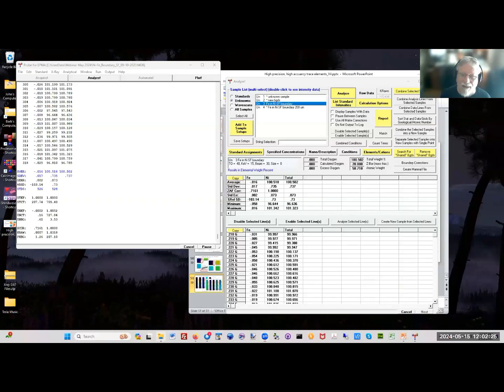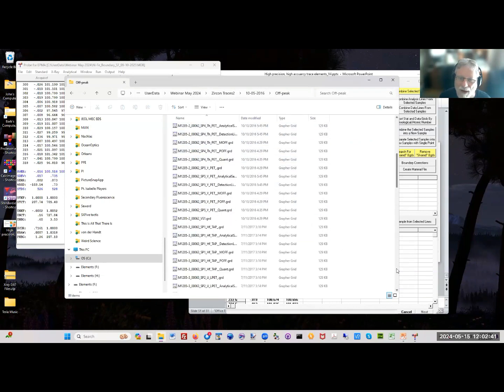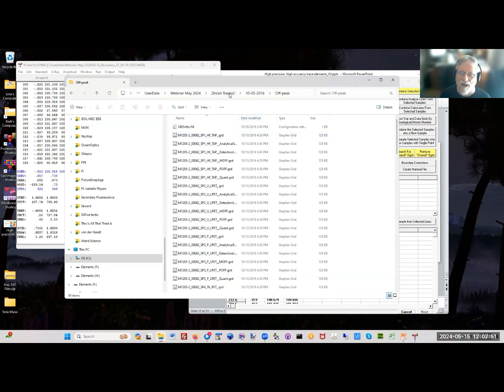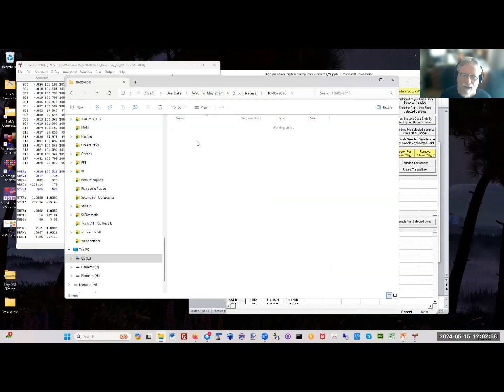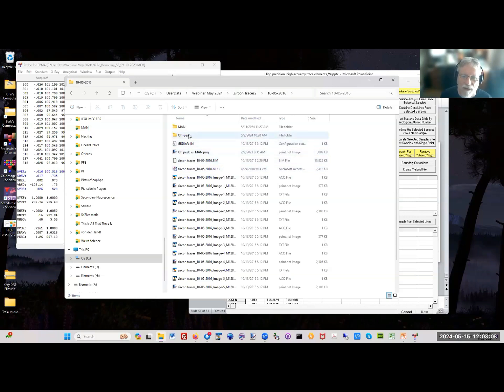Let me just share my screen really quick here again. When you run a CalcImage project, it creates a batch file. Every time you open a CalcImage project and output a new project, it adds a new line to the batch file. And then you can just run that batch file, and it will do all the calculations overnight or whatever time you want it to take.